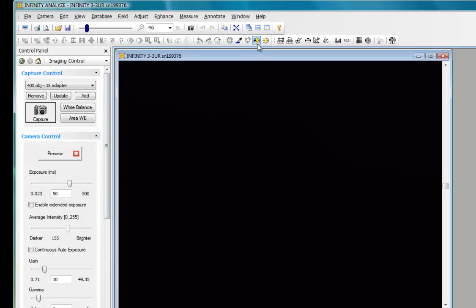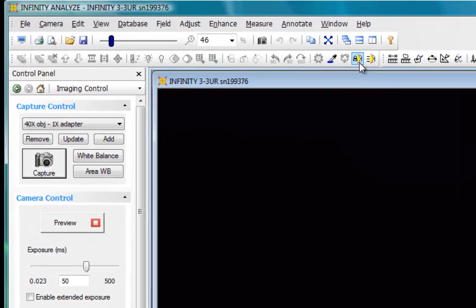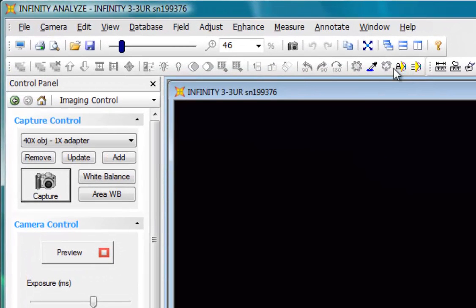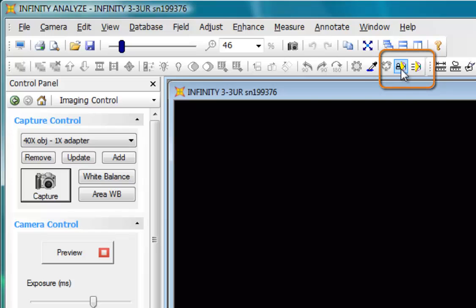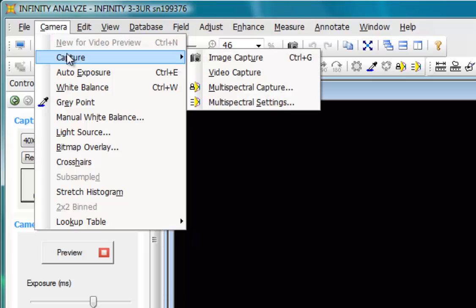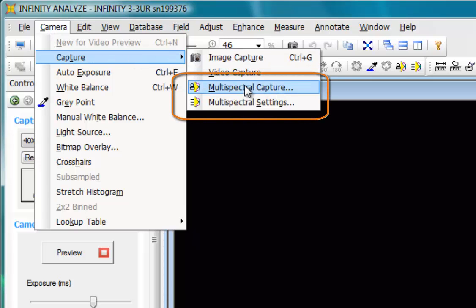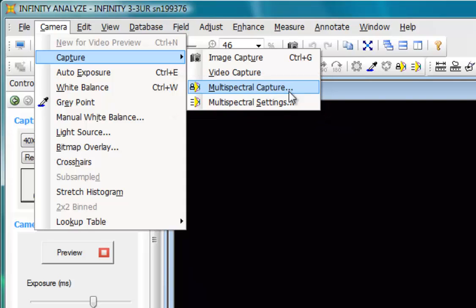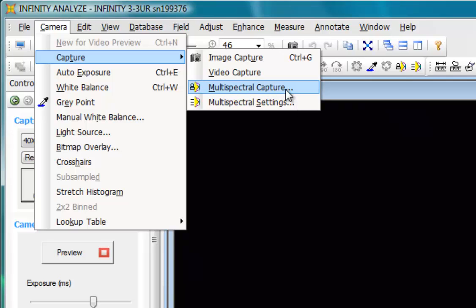When my Multispectral settings have been configured, then my Multispectral Capture icon is available as a push button on my toolbar if that's enabled for you. Otherwise, it's available as a dropdown from the Camera menu and Capture, Multispectral Capture. If you find that Multispectral Capture is grayed out, or if the toolbar icon is grayed out, it simply means that you have not successfully completed your Multispectral settings. You must have two or more channels defined in your Multispectral settings before being able to use Multispectral Capture.